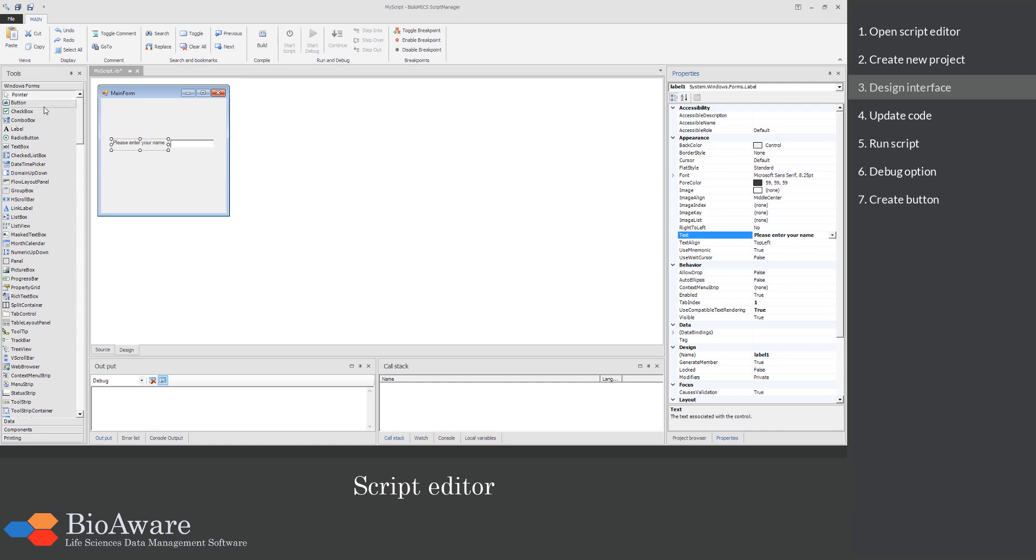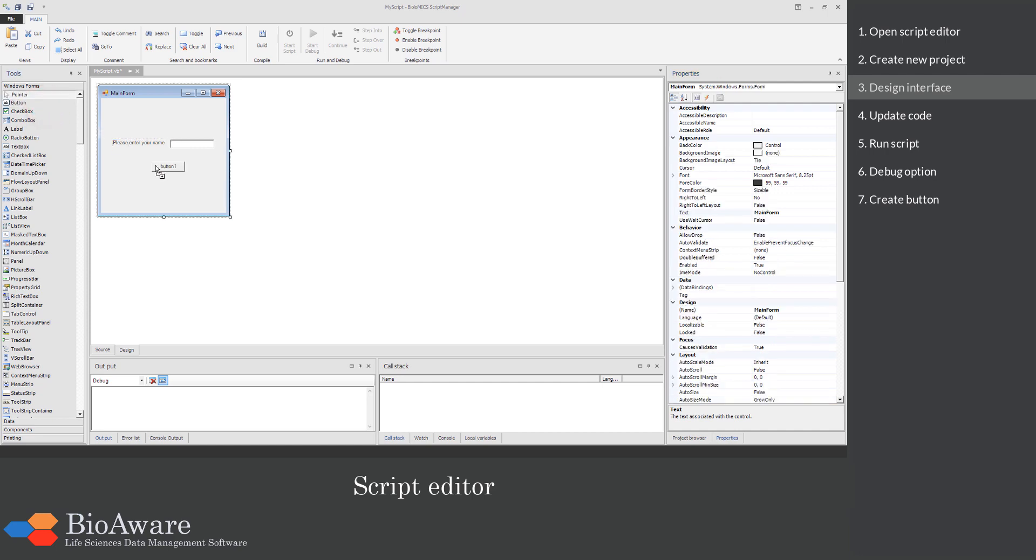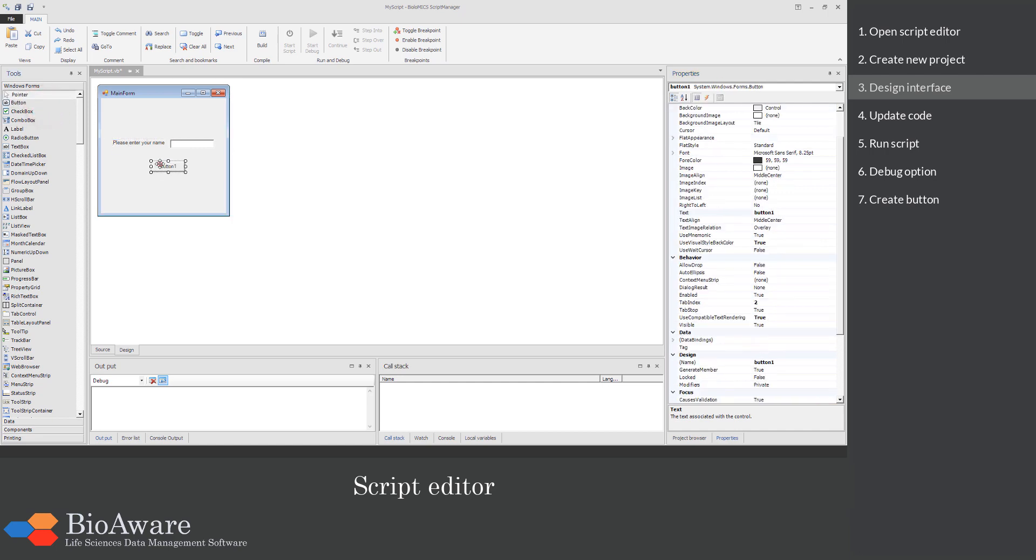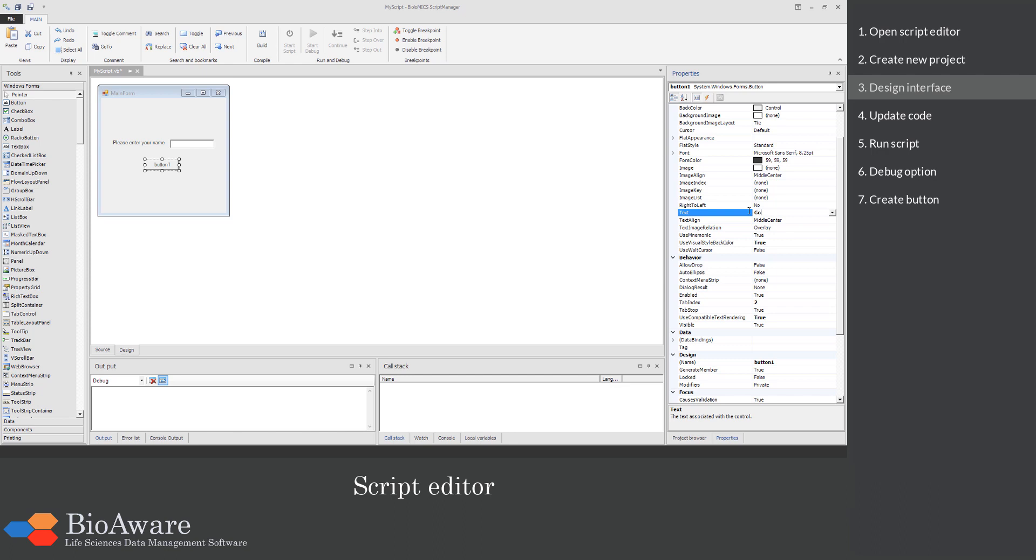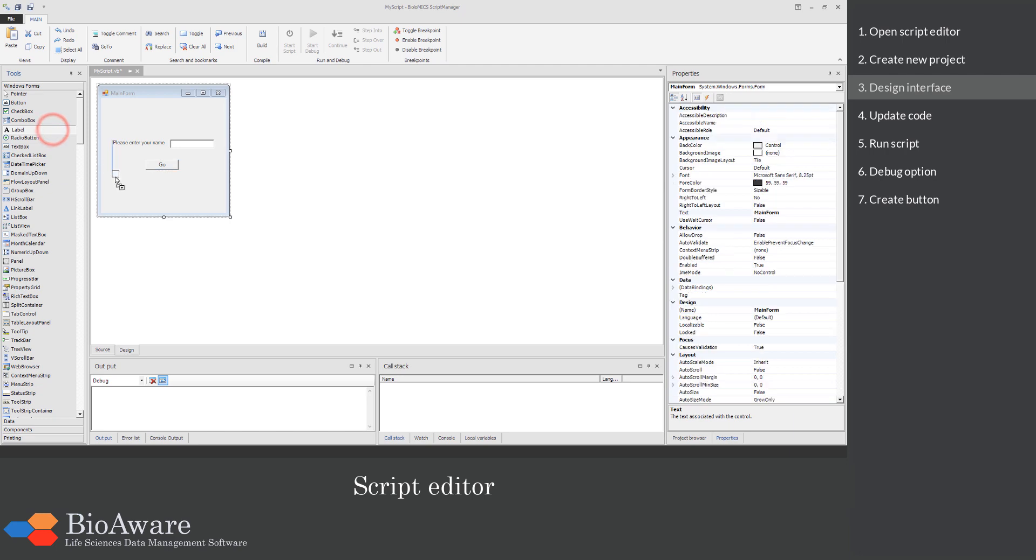We will add a button where the user can click once the value has been entered. Another label will be used to display the results.